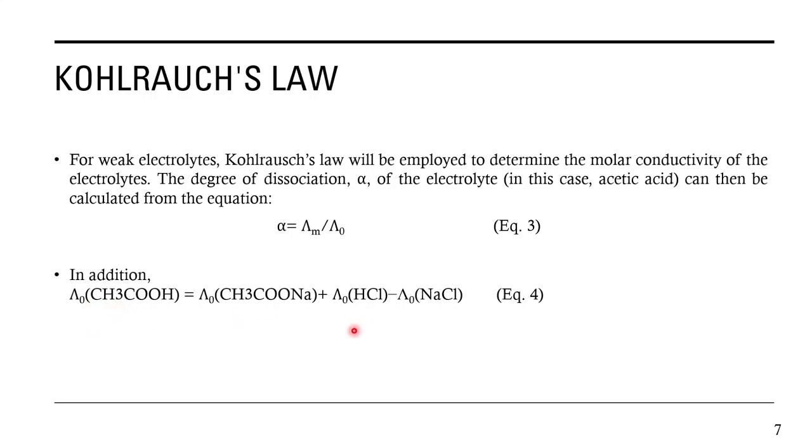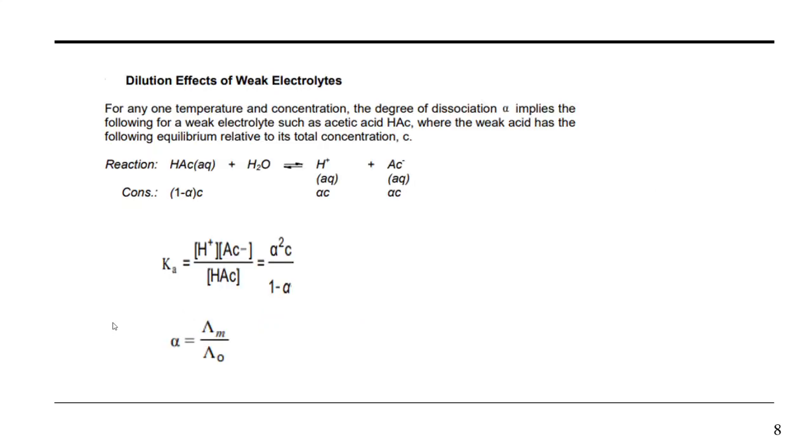Okay, so just use this equation to that. So I do want to mention also that one of the things that you need to measure is the dissociation constant for acetic acid. So you see this equation in your manual.